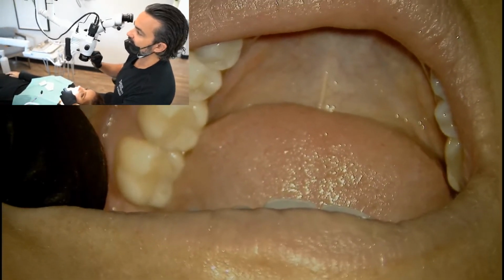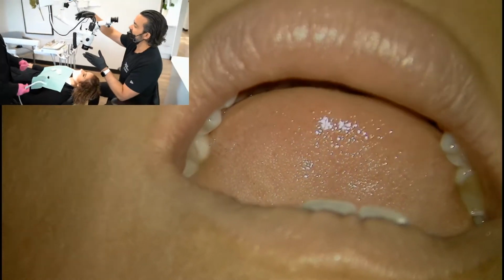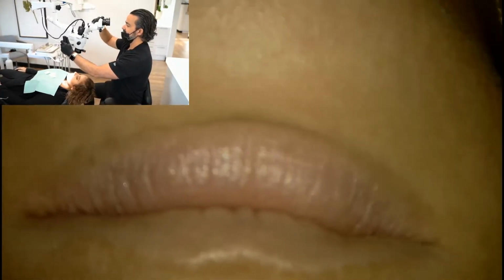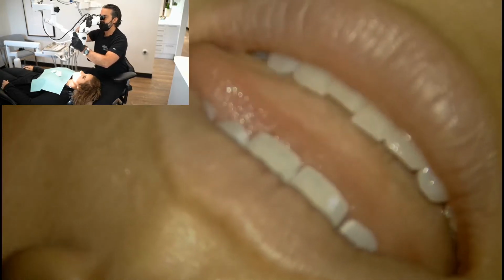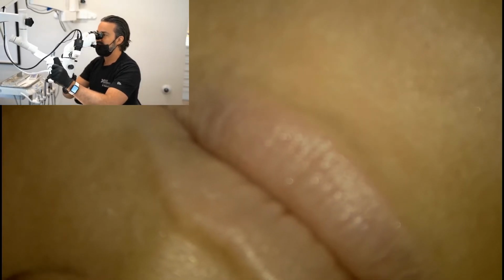And there's always corrections. So the articulation points to the microscope is in the arm, but in the microscope I have this ability, and then I also have this ability. And some of these corrections, like if you want to work from this side, you can put this microscope off axis like this, and then instead of my head being like this, I can rotate it back up and keep a correction.